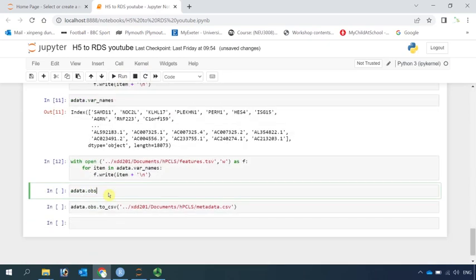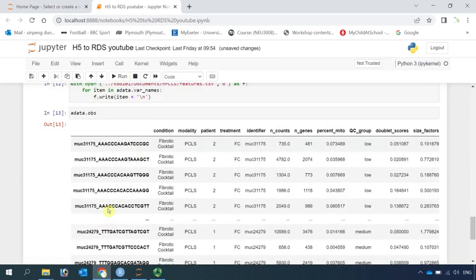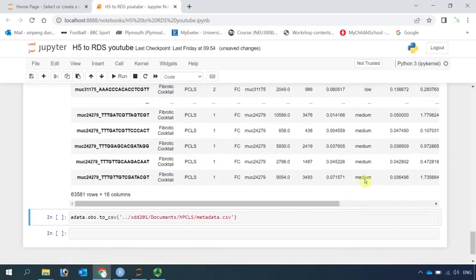In order to produce the same number of cell clusters and the same UMAP pattern, we also need the metadata. So we can have a look at the metadata — here is all the information for it. Now we can also write the metadata.